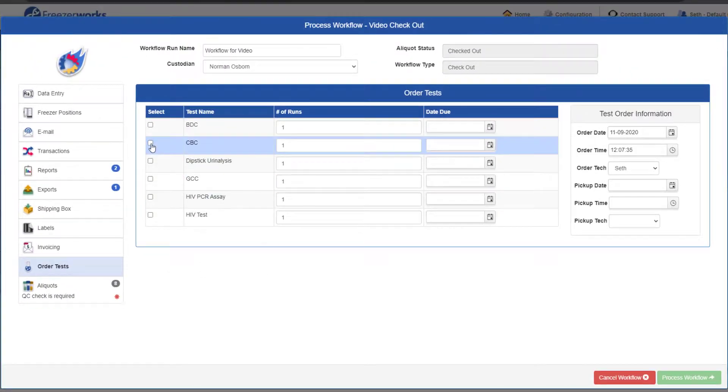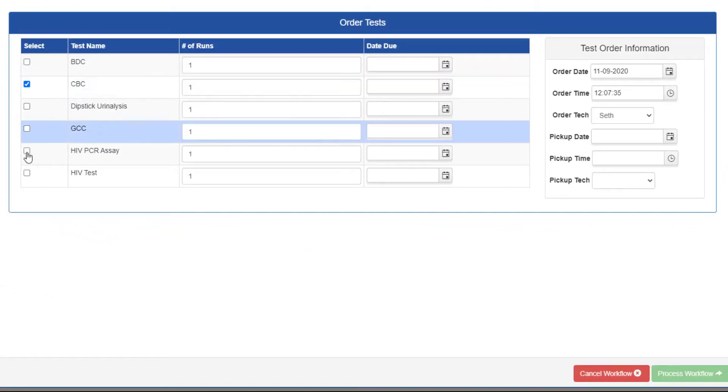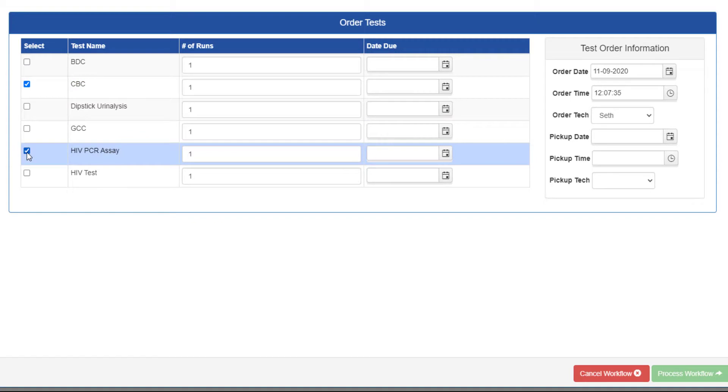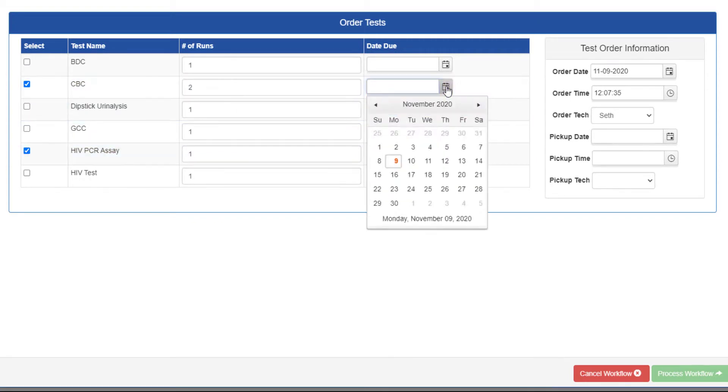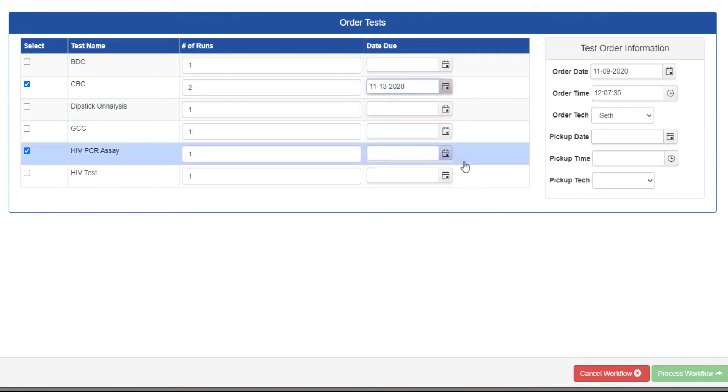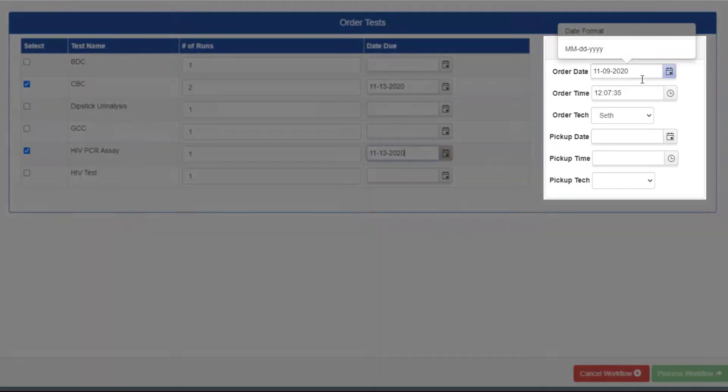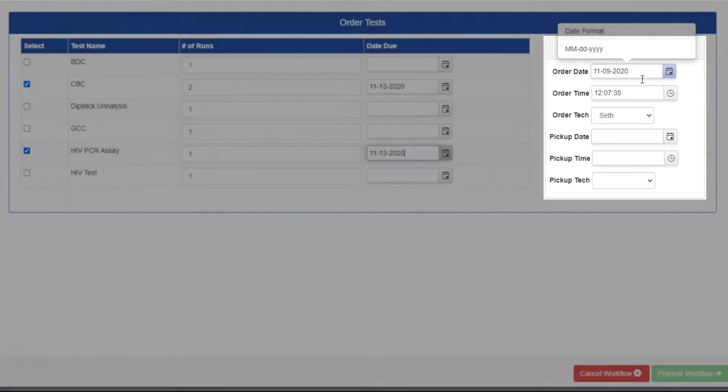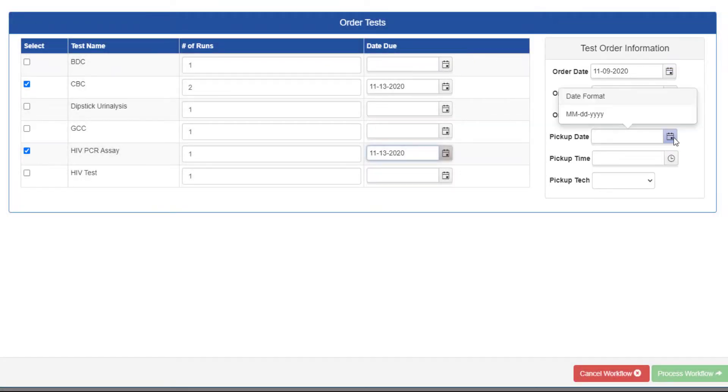For order tests, you can select the tests you want ordered as well as enter a number of runs and date due. You also have the ability to edit the order and pickup date, time, and tech fields. The order info will be prefilled with the current date, time, and user, but it's still modifiable.